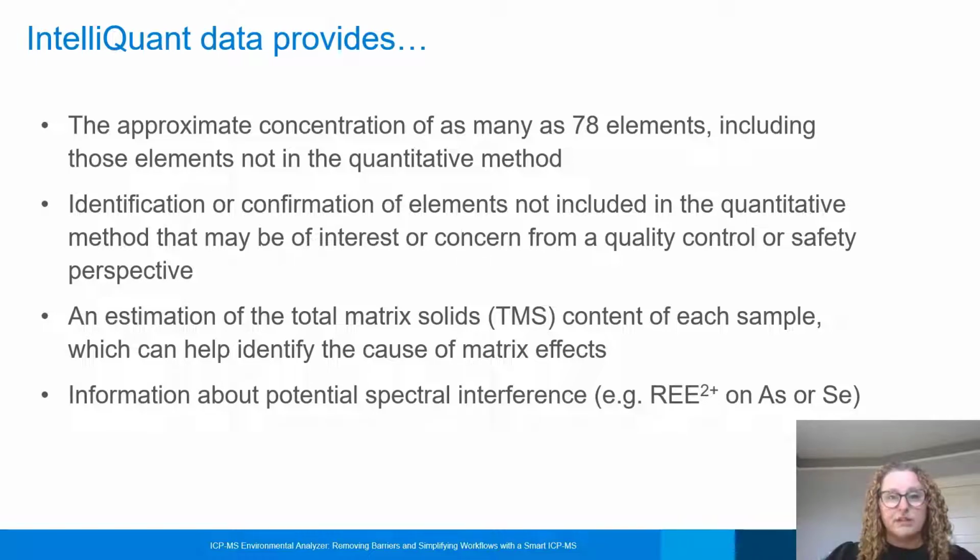Again, for just 2 seconds. It can help you with identification or confirmation of elements not included in the quantitative method that may be of concern or interest from a quality control or safety perspective. It can also help you with estimation of your total matrix solids, or TMS, of each sample that you run. This can really help when you're trying to identify the cause of different matrix effects.